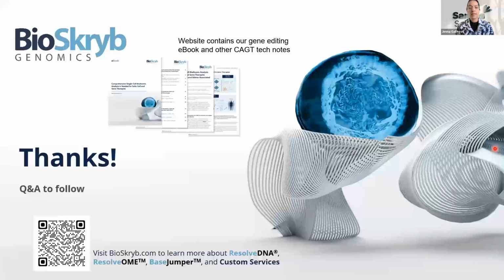Awesome. Thank you. Really interesting question. Considering that we're using cancer cell lines and they may be experiencing genomic instability, how do you discriminate between spontaneous and CRISPR-induced translocations?